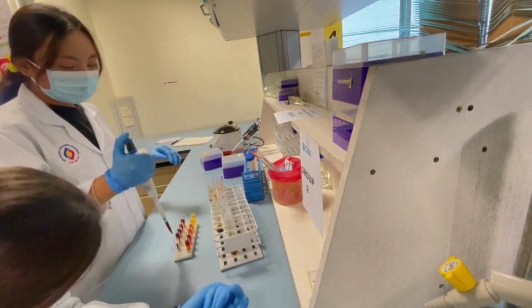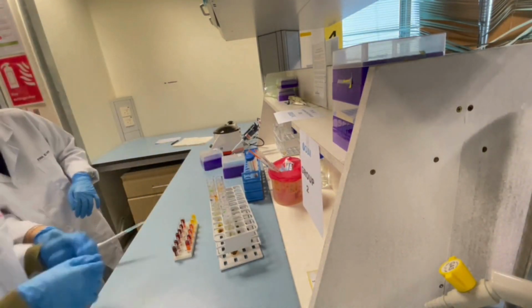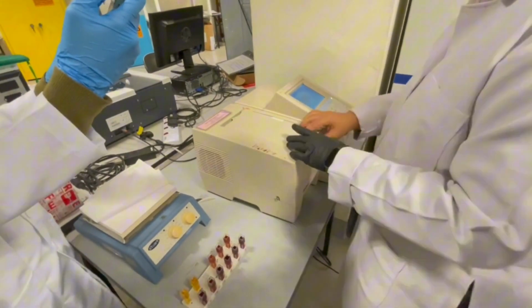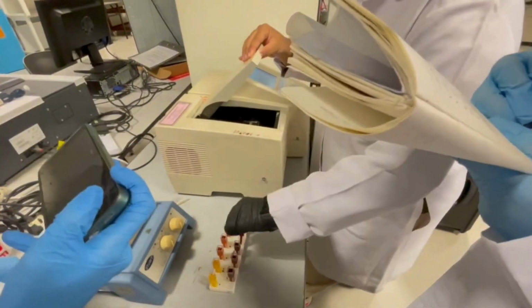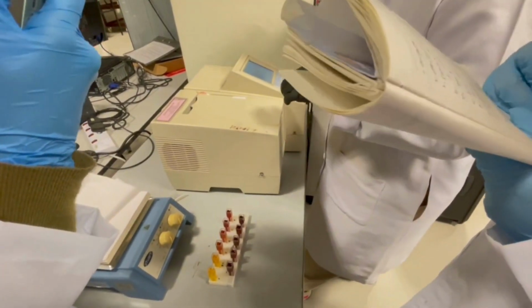Next, the solution is transferred into the cuvette. Last step, the readings of absorbance are tested and recorded using the spectrophotometer. The readings start from test tube 1 until test tube 6.